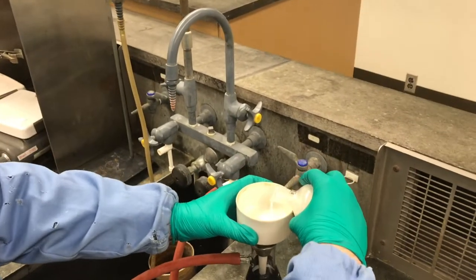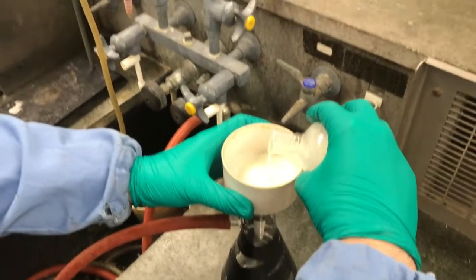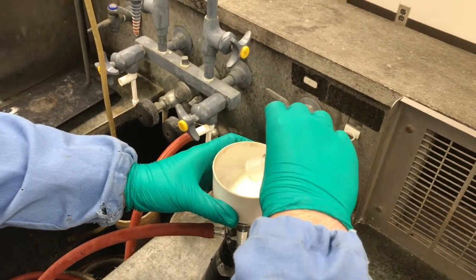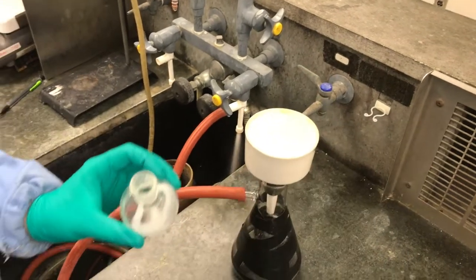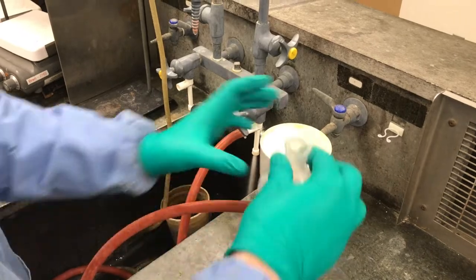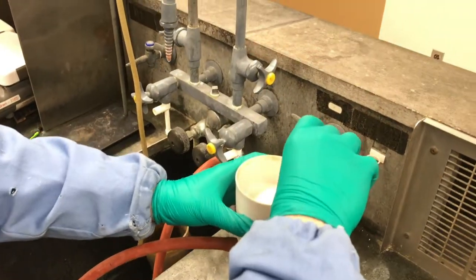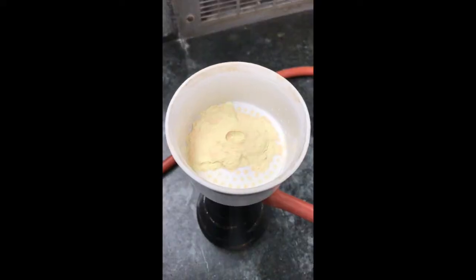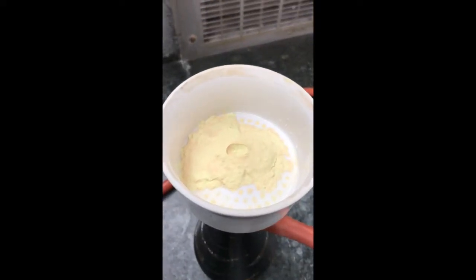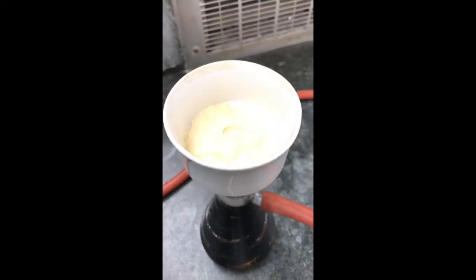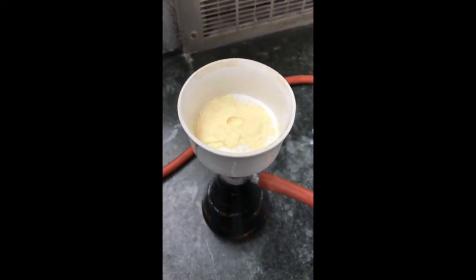The workup for this reaction is pretty straightforward. All we're doing is just filtering our reaction mixture. And we're washing with cold water. So here we have some cold water. We're just going to rinse out the rest of the reaction mixture. And then we're going to filter it. And here's a close-up of what that product looks like for the elevated temperature reaction. It's slightly yellow in color. And it's a solid.